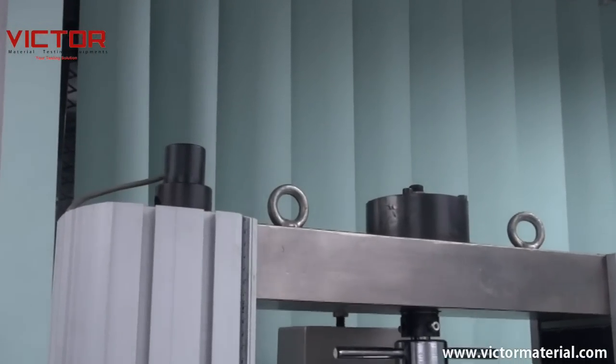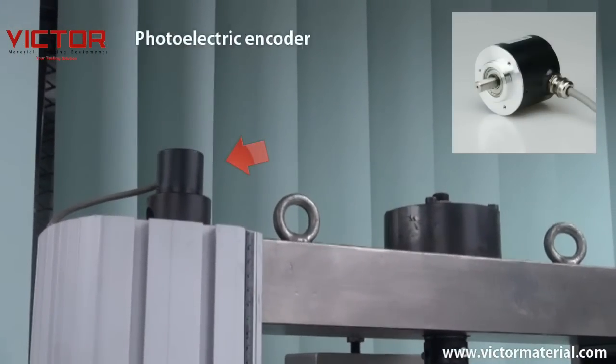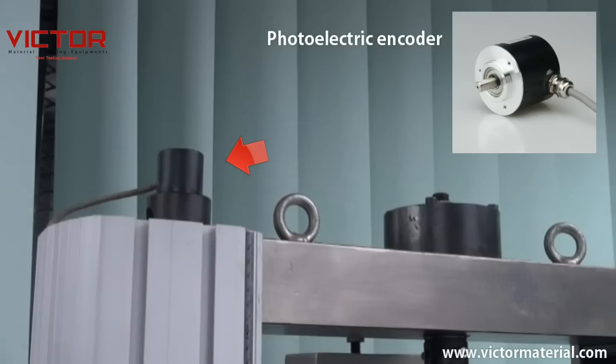Victor's displacement sensor uses a high precision photoelectric encoder to control crosshead displacement with resolution up to 0.001 millimeters — that's 1 micron.